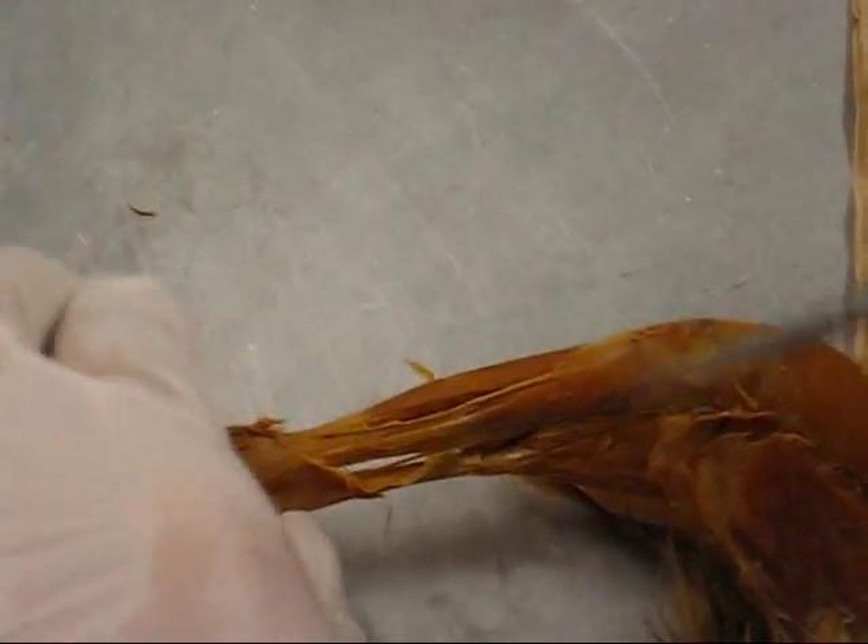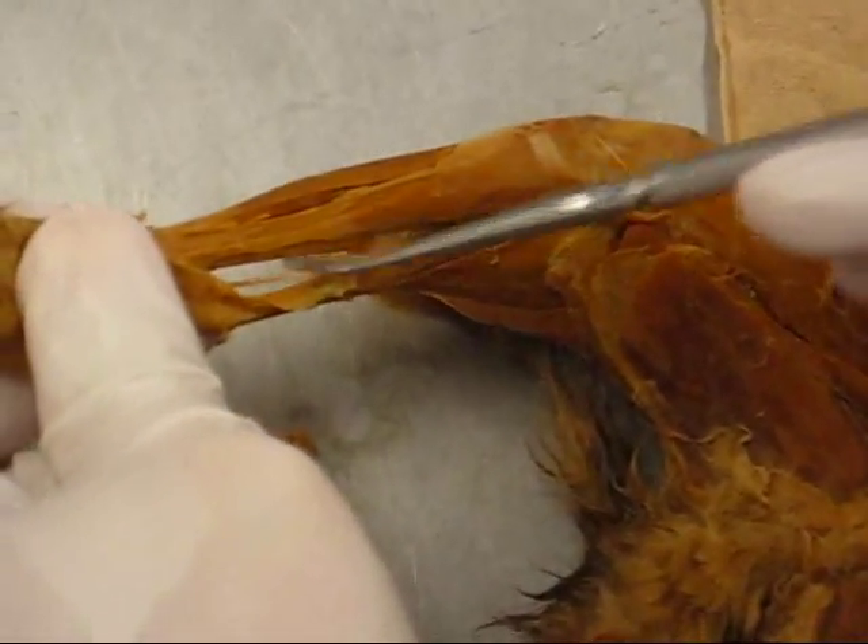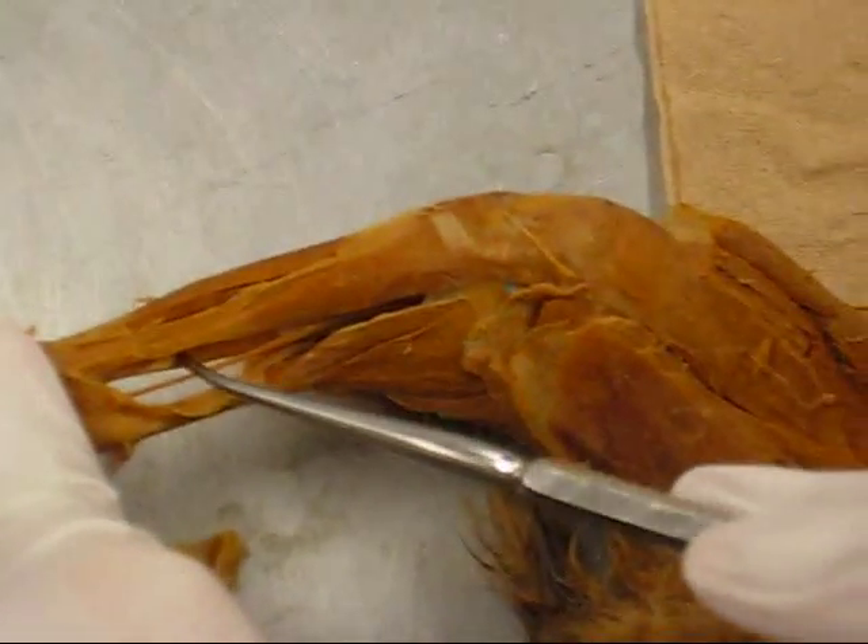Tibialis anterior and tibialis posterior — all you can see is the ligament.